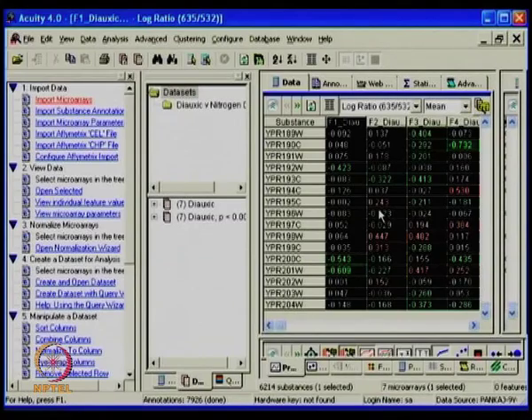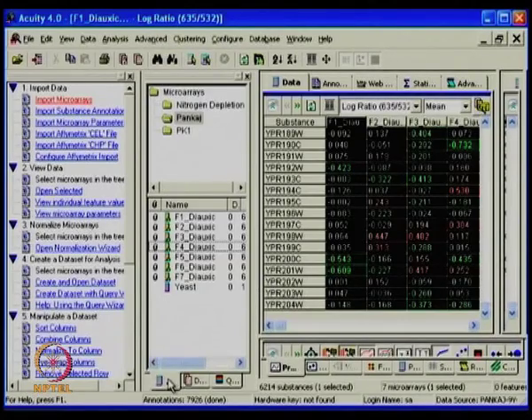Right. So usually differential expression data is logged. The meaning of log to the base 2 is essentially that a log to the base 2 value of 1 is equal to twofold change. So log to the base 2 value of 2 means you're talking of fourfold change, which really becomes significant. You can filter based on different parameters and generate the data sets. So essentially you are reducing the numbers, so you make more sense in the form of visualizations. Right. Otherwise you can also take all the data and do it. Let's quickly see how we can do that particular job.